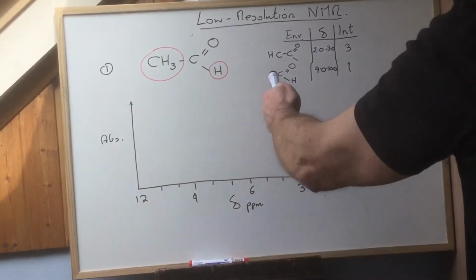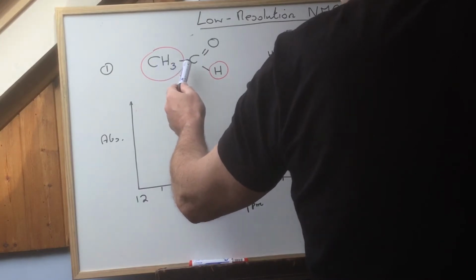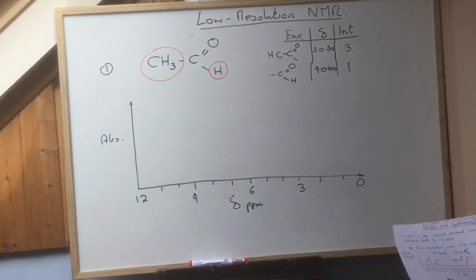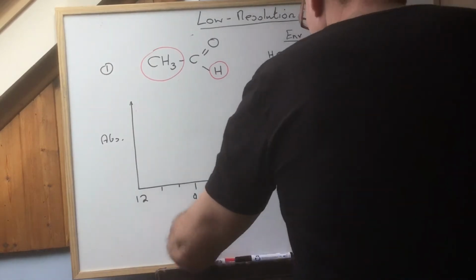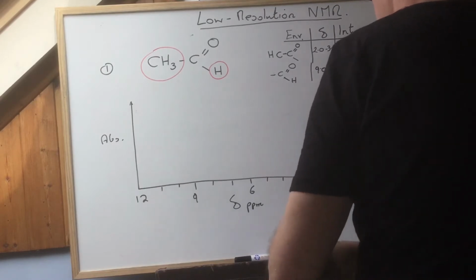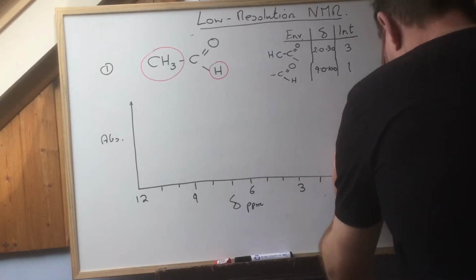Right. So what's this spectrum going to look like of this? What is it again? Ethanal, an aldehyde. Okay. So dead easy. You're going to get this. At 0 is your tetramethylsilane peak there. Okay, a peak there. Why is it there?